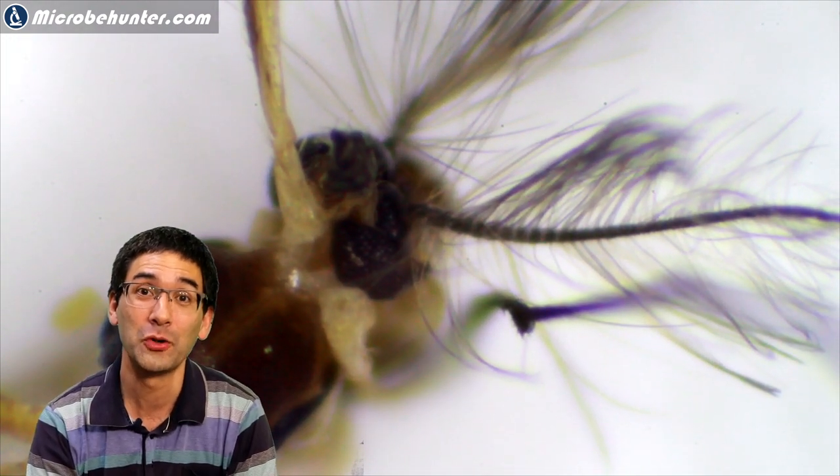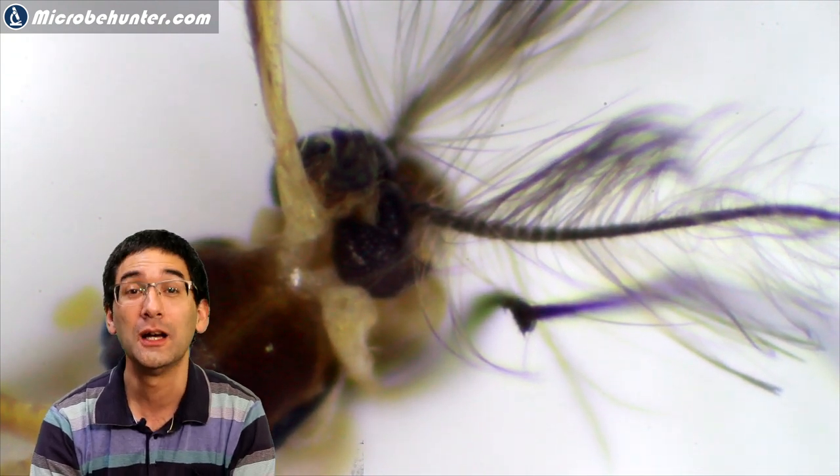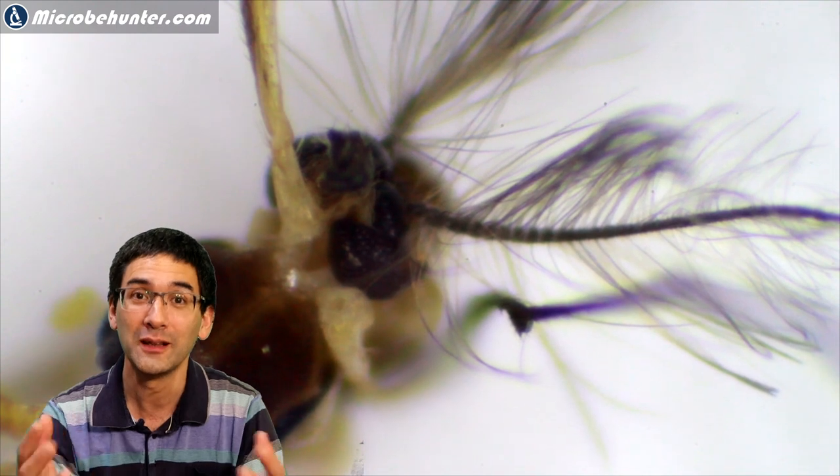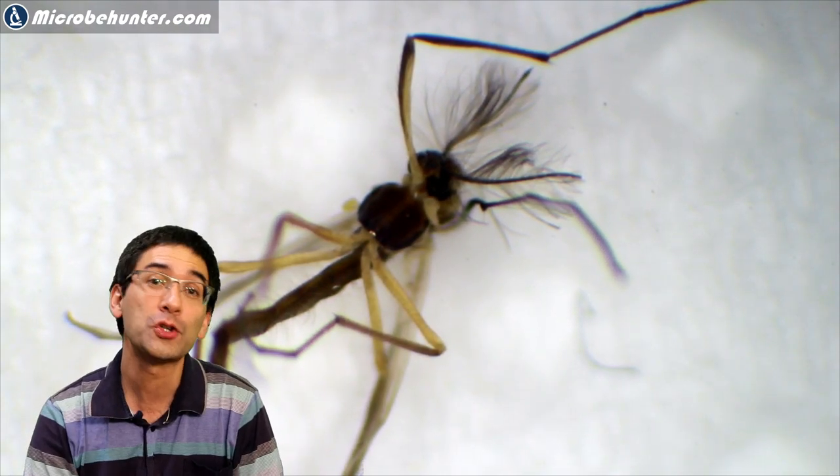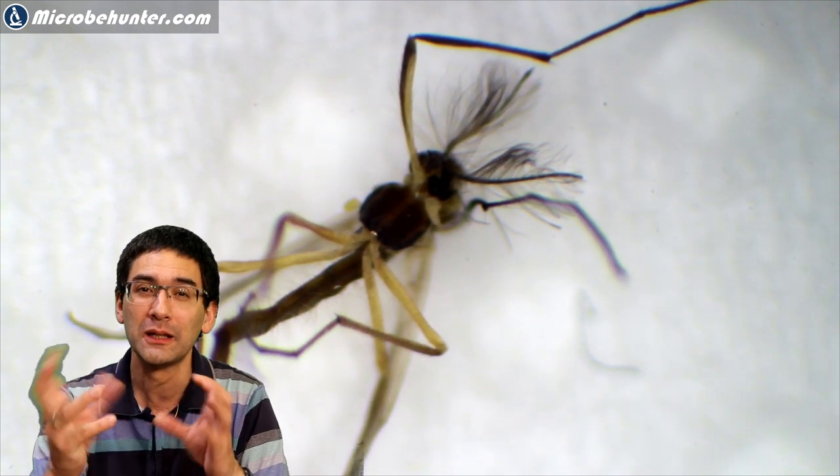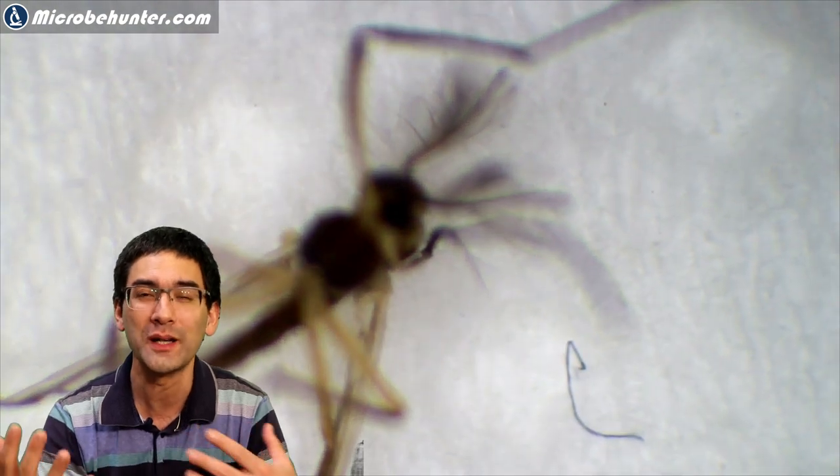If you look at it under the microscope, you can see quite a lot of intricate details. Unfortunately, the alcohol not only killed the insect, but because alcohol withdraws water, it causes the insect to shrivel up a little bit and become distorted and dried up. That's why the appearance is not quite as nice as you'd probably expect.